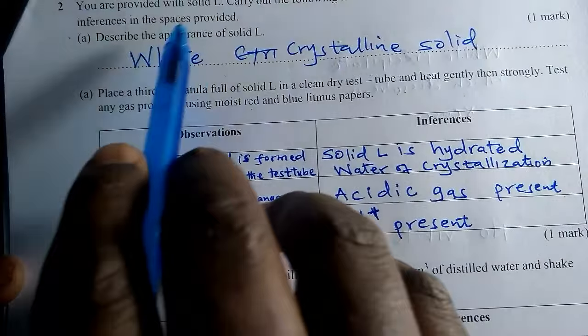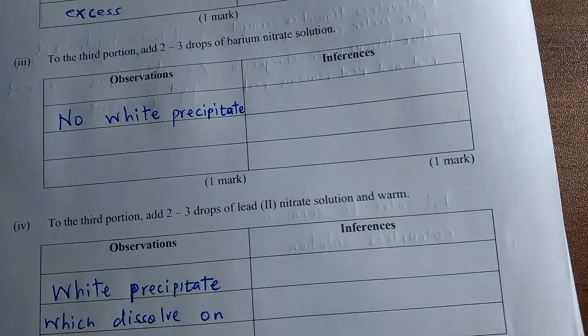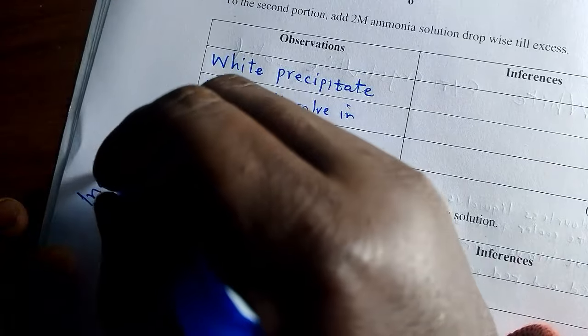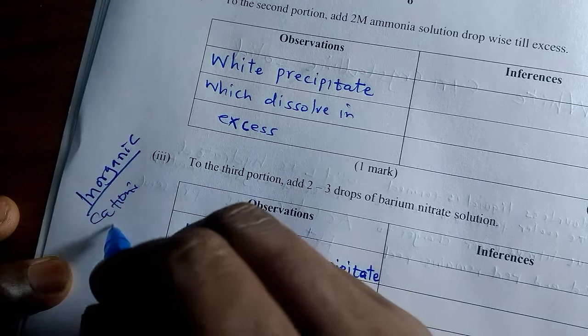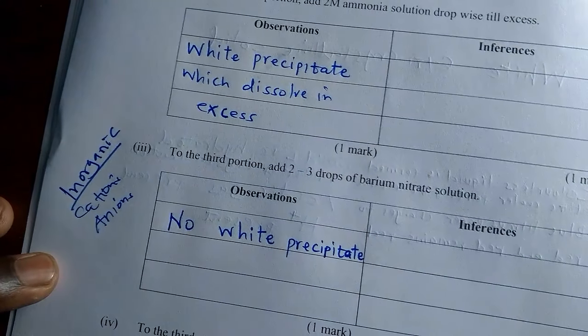The next I have ammonia solution, I have barium nitrate, I have lead. Therefore, this side, number 2, is inorganic, which tests only the cations and the anions, right?